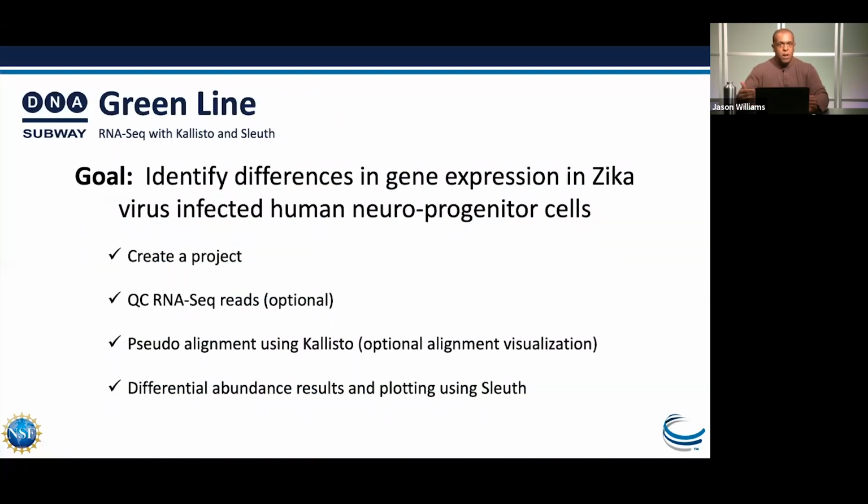Okay, so let's talk about what I'm going to attempt to do over the next 45 minutes or so. Look at my watch. We are going to attempt to go through a tutorial and pull out the highlights. I'll be paying attention to questions. I may not answer every one of them in that second, but towards the end, we'll have some time for any questions that may have accumulated.